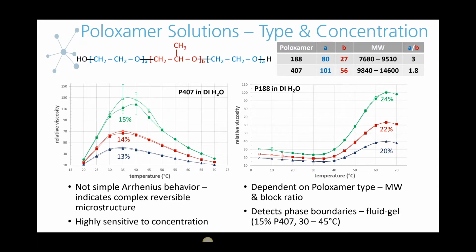And I had mentioned before that one of the advantages of our software is that we can operate in automatic mode. So I had no idea ahead of time how these samples would behave exactly. So what we were allowed to do is use this mode, this feature, and it would then scope out the situation and choose the appropriate shear rate for each temperature so that we didn't overload the system. But we haven't then fully explored the shear rate dependence that could exist at each temperature.